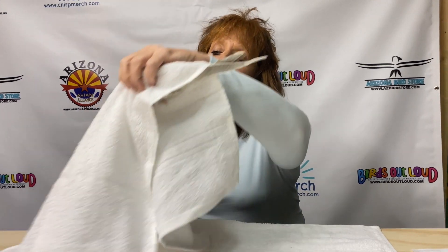Hi, this is Debbie from Birds Out Loud, and we are going to demonstrate how to pull blood for doing a DNA sexing.